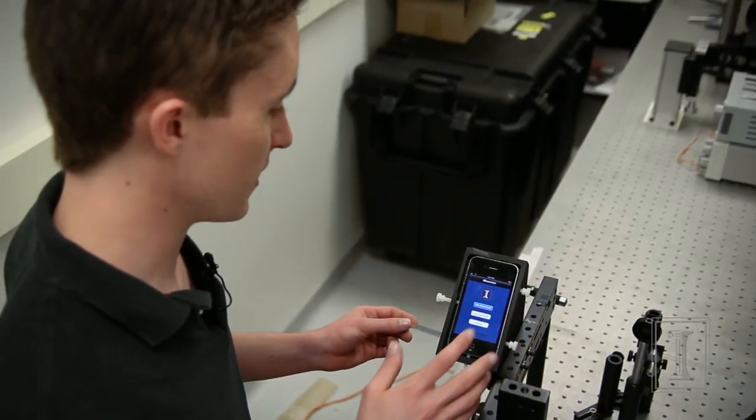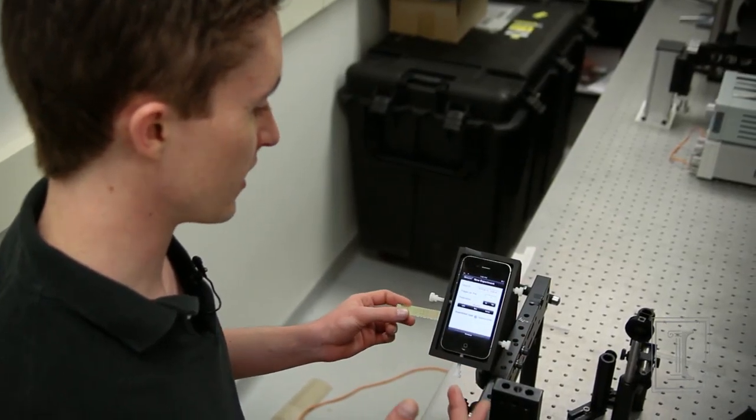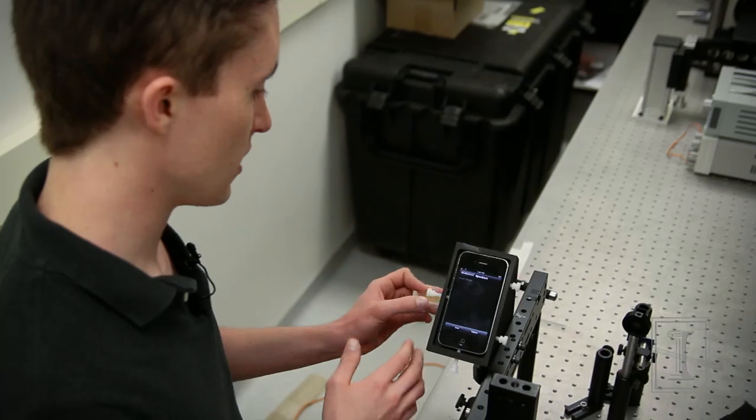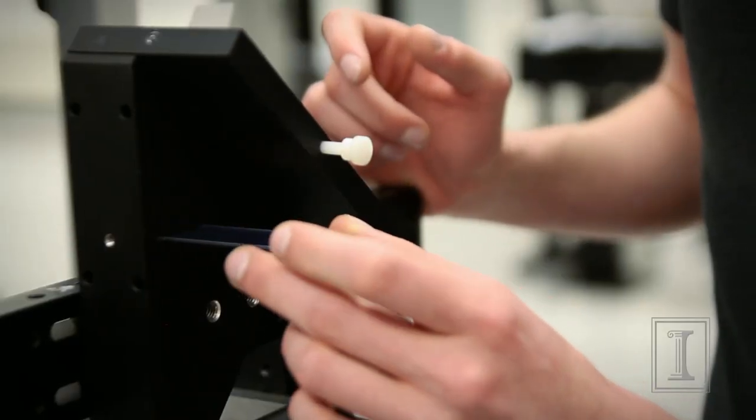So first off we're going to select a new experiment. We're then going to take our sample and we're going to put it in the little cartridge position right back here.